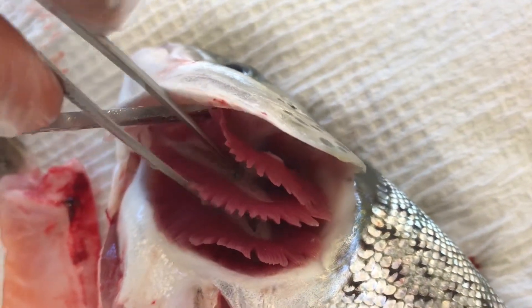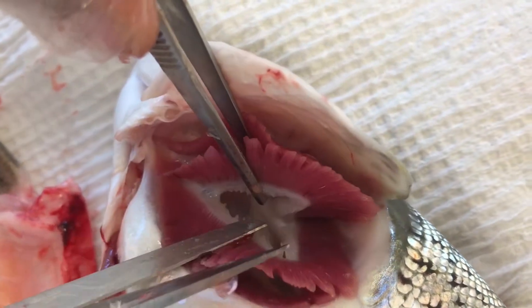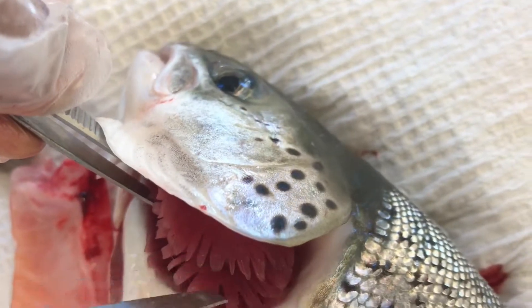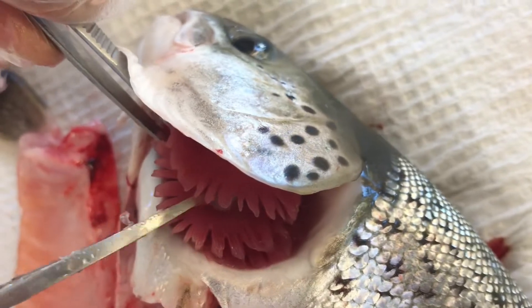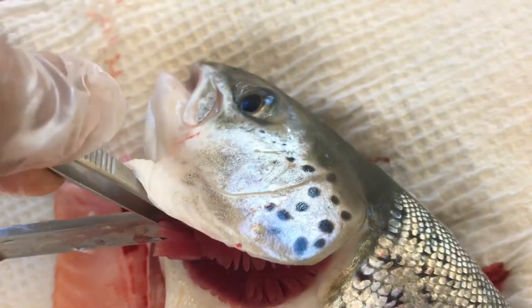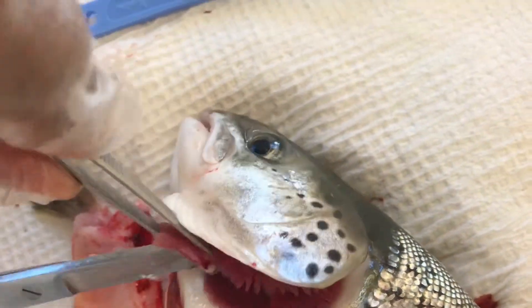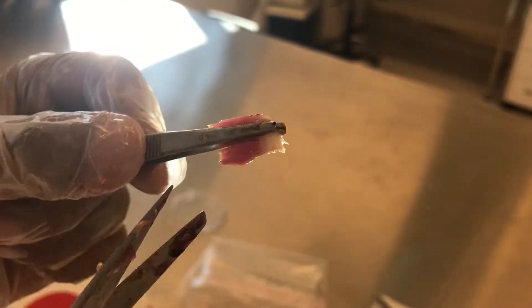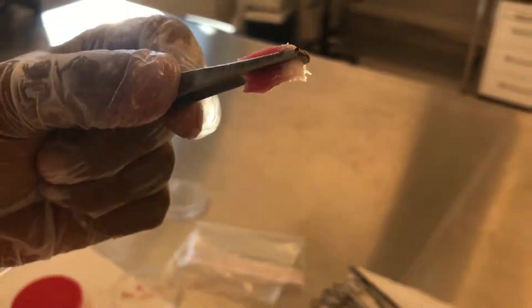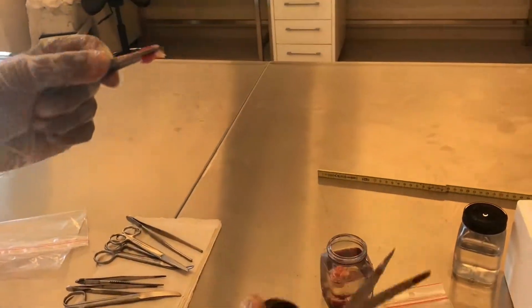Usually we take a two-centimeter piece of filaments from the second gill arc. This is the second gill arc. Try to avoid damaging the filaments, as that might create artifacts during histological examination.